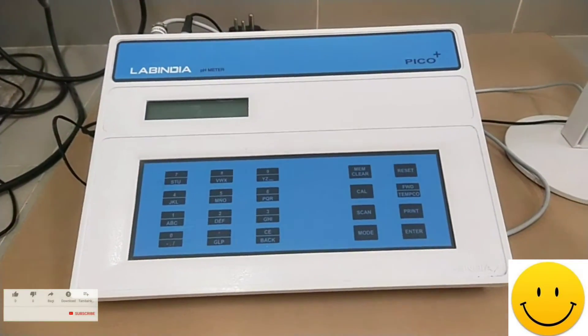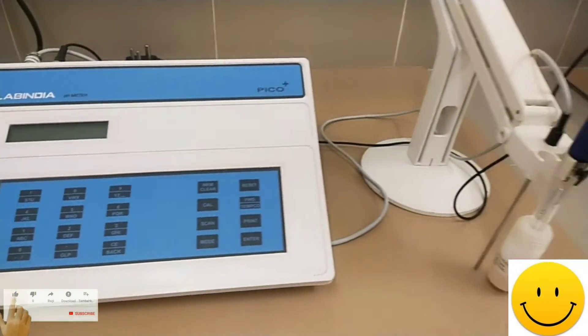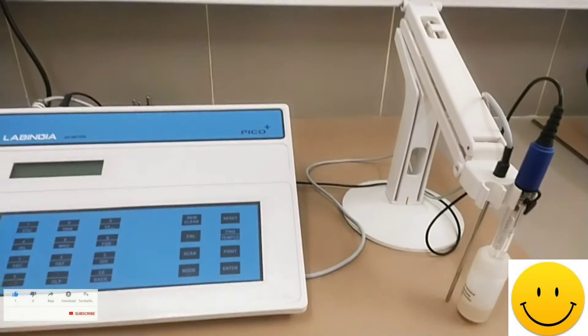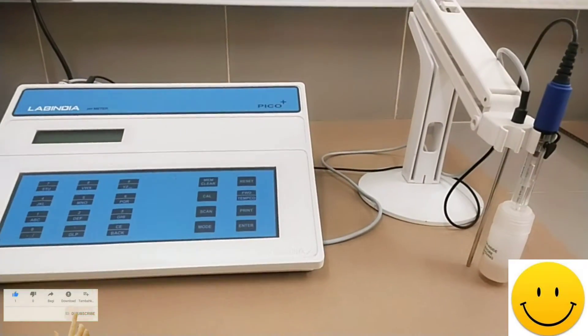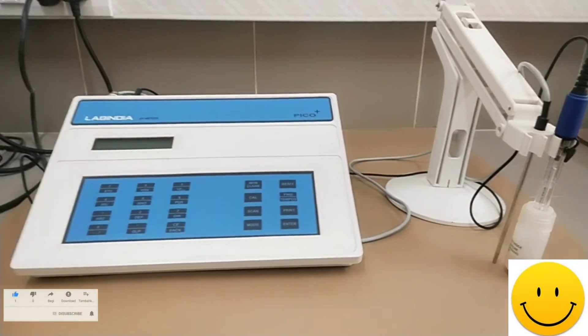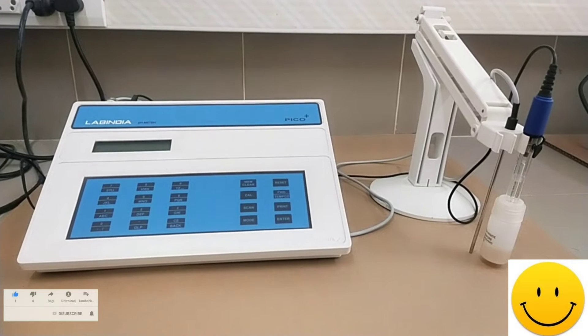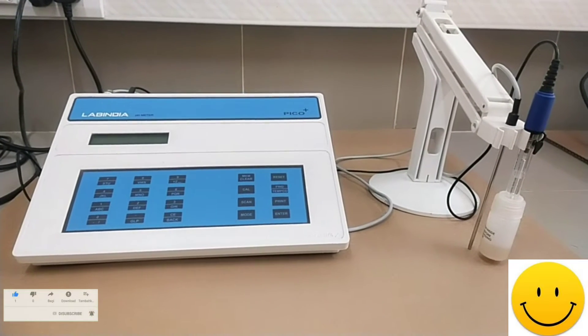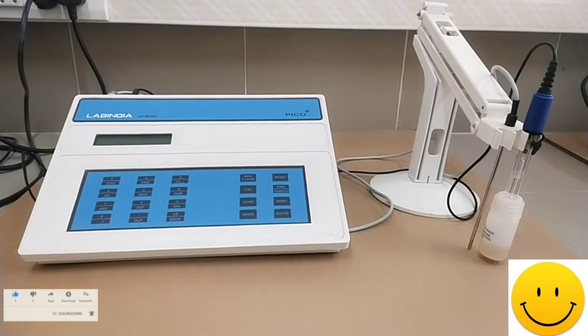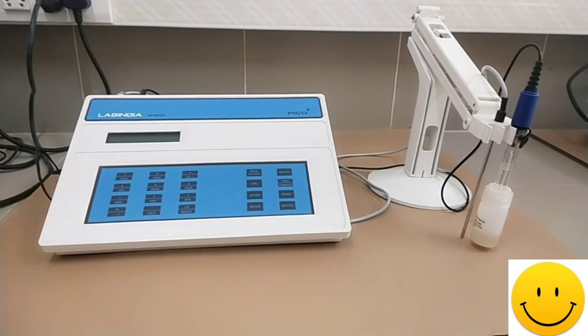This is PICO plus pH meter lab India. pH measurement is one of the most common requirements of today's laboratories. This is a bench top pH meter used in every laboratory for routine measurements as well as research and development work.